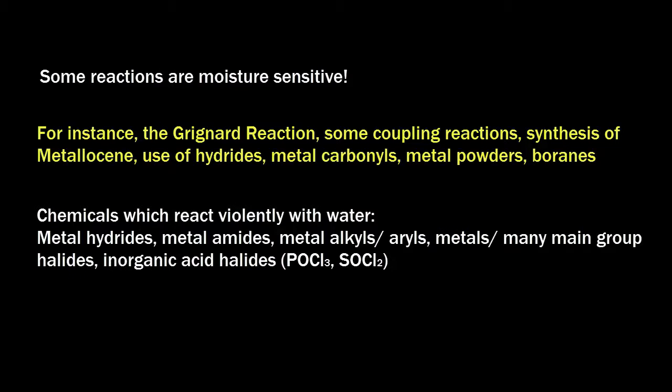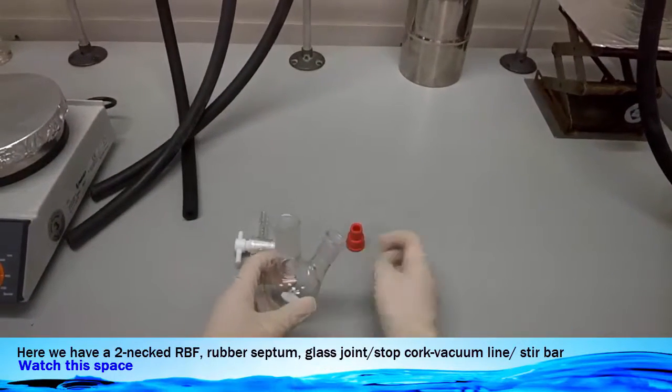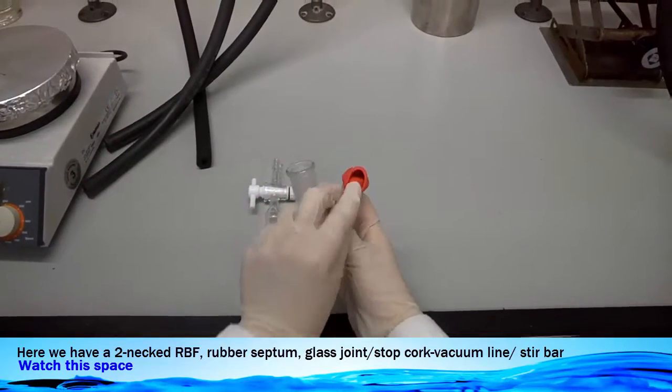So it is very important to make sure that your glassware, especially in this case, the round bottom flask, is totally dry and free of moisture. So here we have a two-neck round bottom flask, rubber septum, a stirring bar, and the vacuum line adapter.